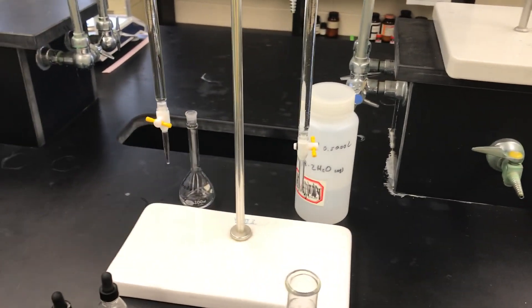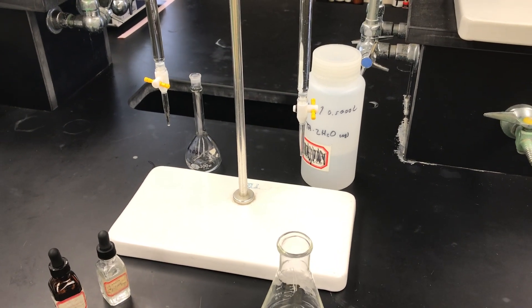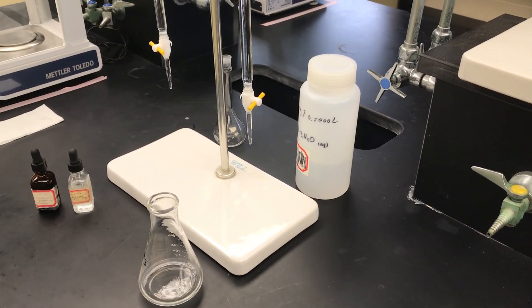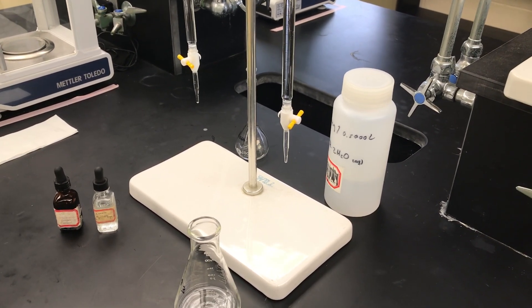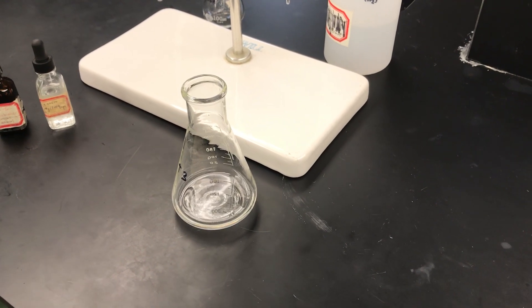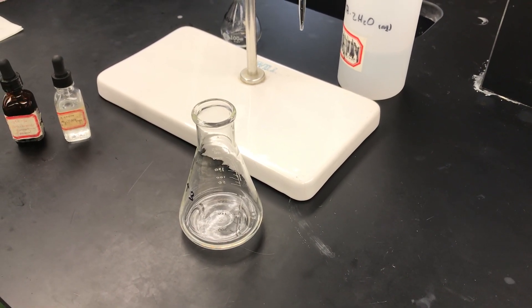I've got a couple of burettes set up here. The one on the left contains the calcium aqueous unknown. For this particular trial I have measured some of that out — I have an initial volume of 0.25 milliliters and ended at 20.45 milliliters of that solution, which is what I have in the Erlenmeyer flask. I've also added two milliliters of the ammonia/ammonium chloride buffer to that.